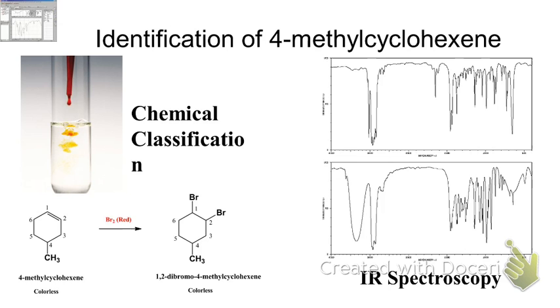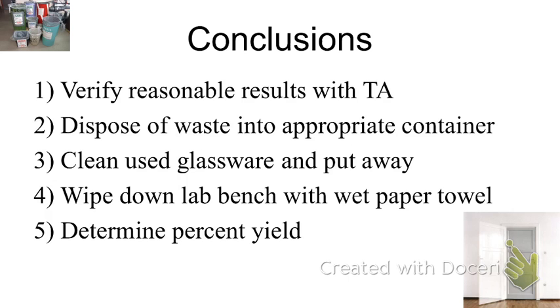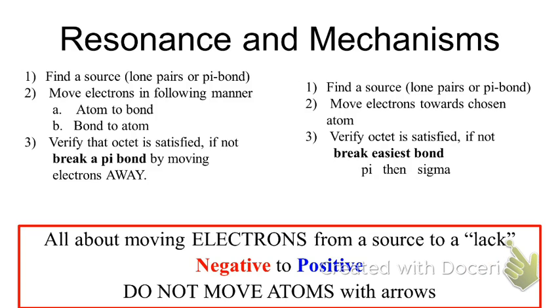If you go through that whole process and you end up with some weird liquid at the end and you add bromine to it and that solution turns brown, what does that mean? You didn't have the alkene product, or at least you didn't have an alkene. Okay? The very end of this would be concluding everything. I'll let you read over that because I don't think it's all that important. But I didn't say that on record. Actually, I think I did.